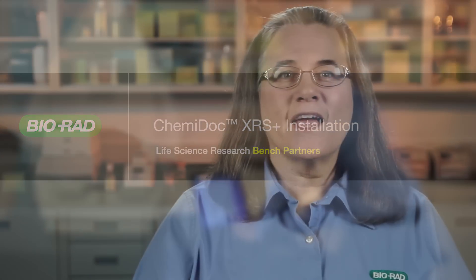Congratulations on the purchase of your ChemiDoc XRS Plus system. Installing the system may appear daunting, but with the installation guide it's really quite easy. The guide can be found packed with your instrument, in the email you received after purchase, or you can download one from the Bio-Rad website. In the next few minutes we'll show you how to unpack the instrument, install the hardware and software, and calibrate and test your new ChemiDoc XRS Plus. So let's get started.